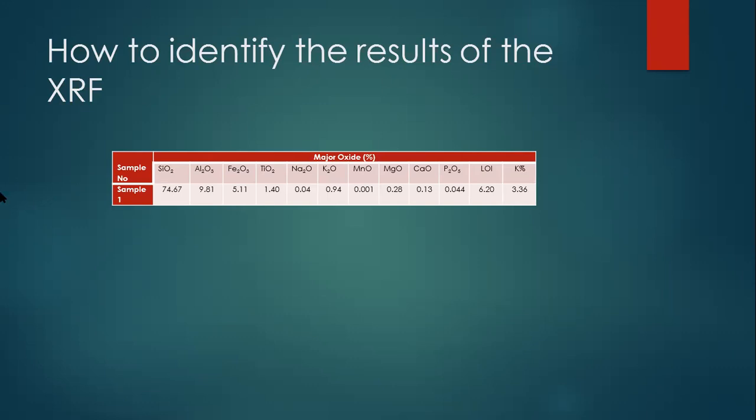This sample refers to kaolin materials. And why do we say kaolin? Because in the XRD before, we identified the material as kaolin. So here, we made this analysis for these kaolin samples, and it has shown us the major oxides we have inside the sample. After this, we can compare this result with the typical analysis for the minerals that we are looking for.